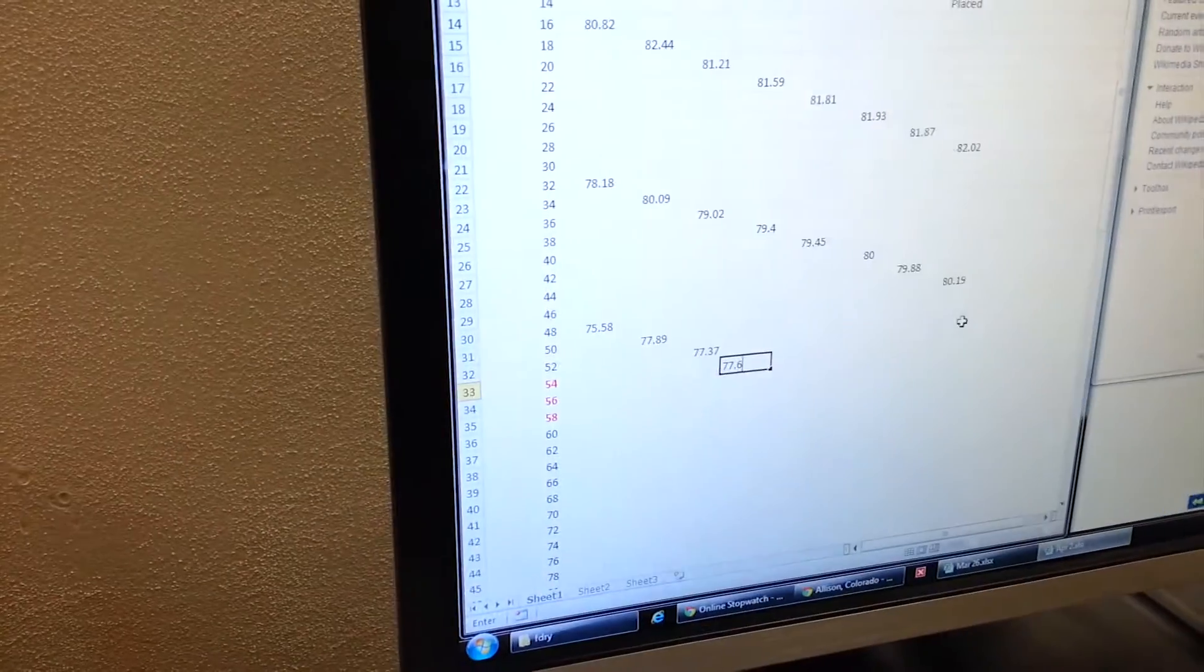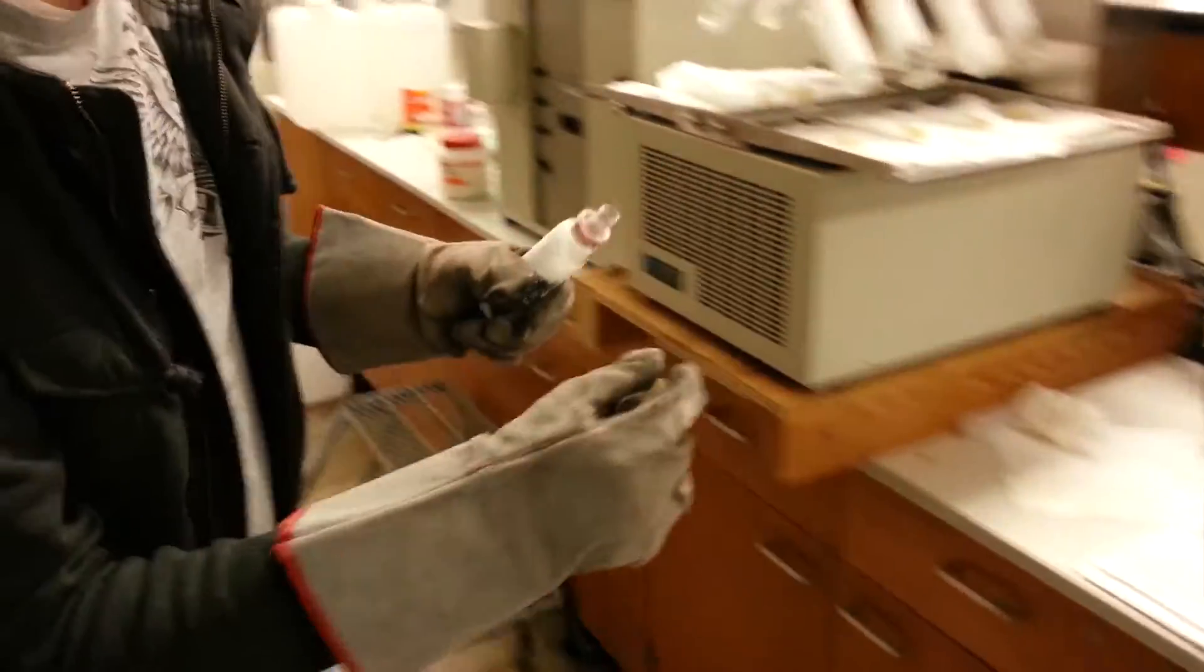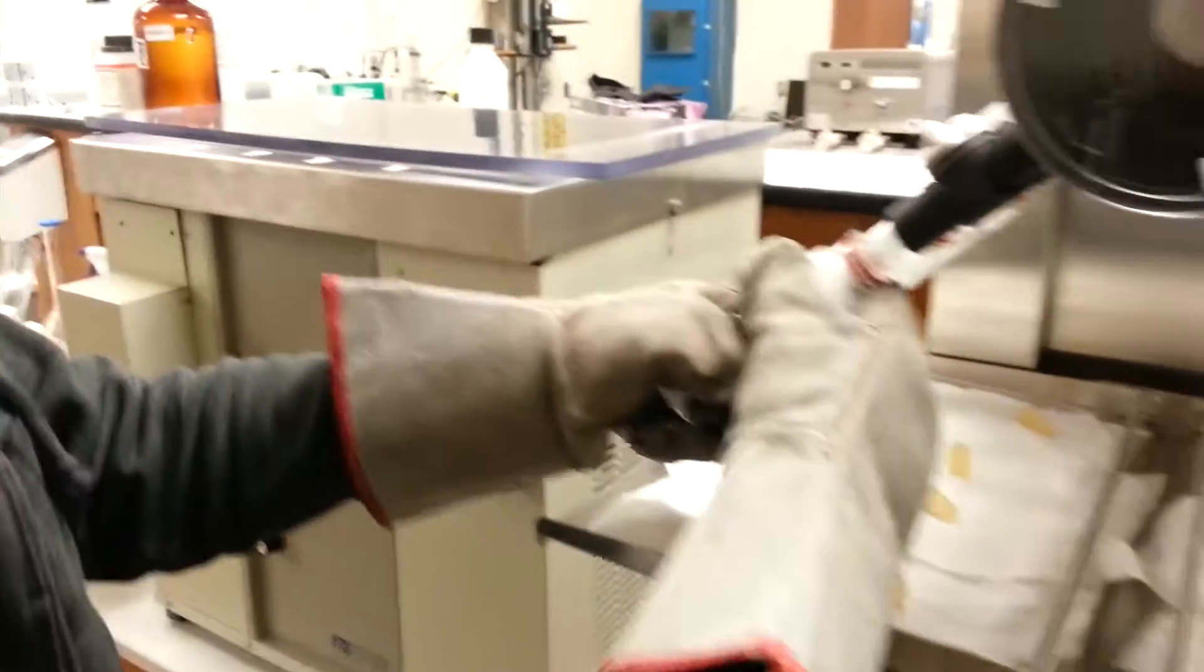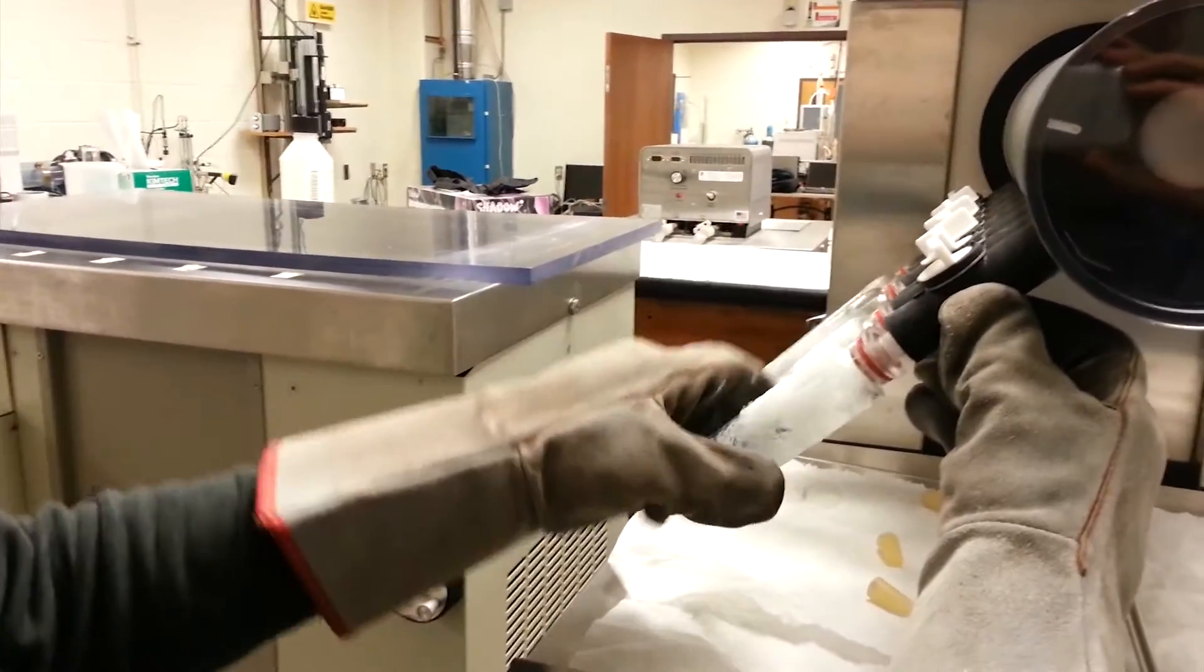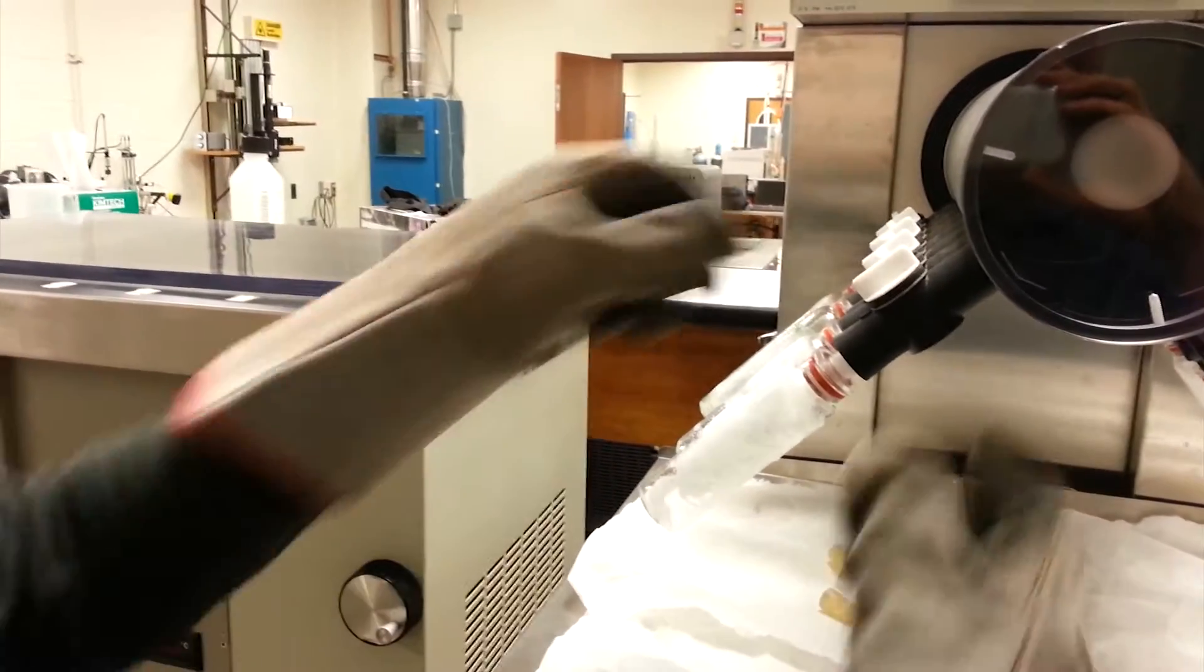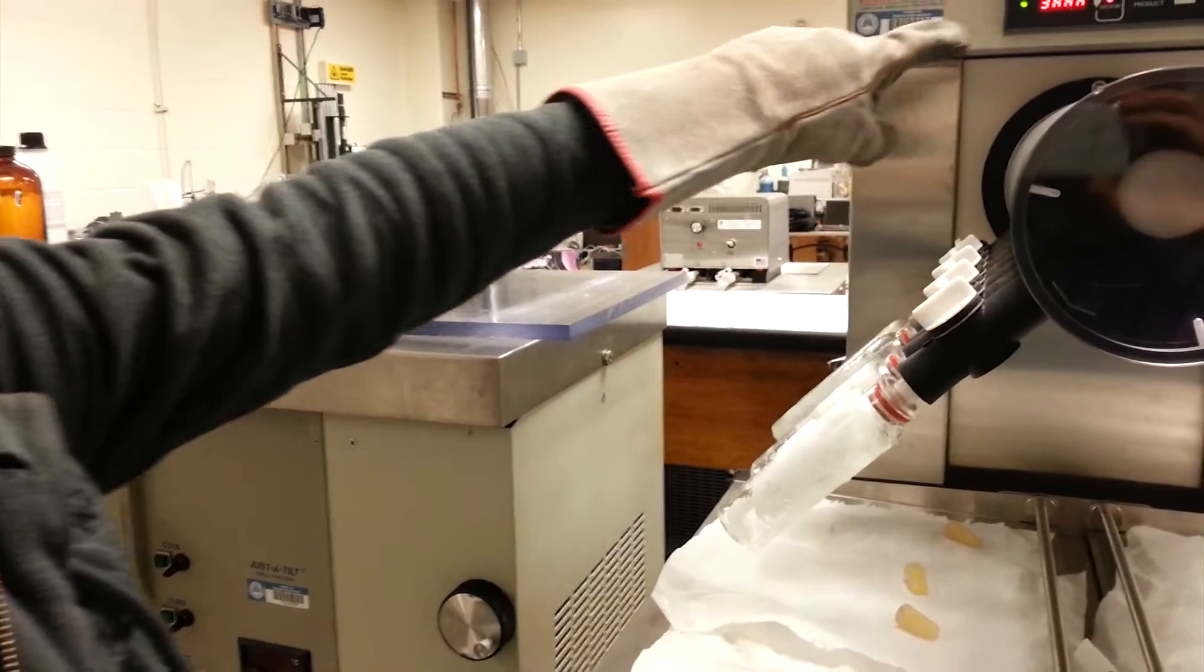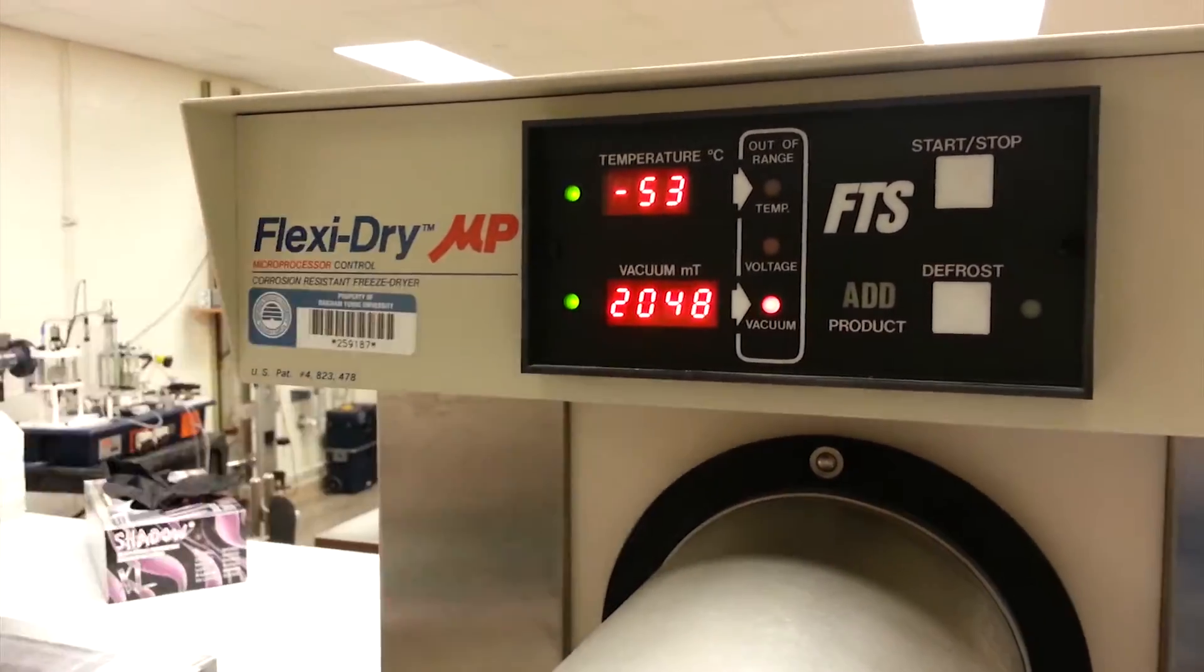77.6. Good, and then we'll just take it and we're going to stick it right back on as quickly as possible. And these are a little hard to get on but you just kind of do it hard and then turn this up, dial up so that it can recalibrate and gain that vacuum back. And that should start counting down like it is now.